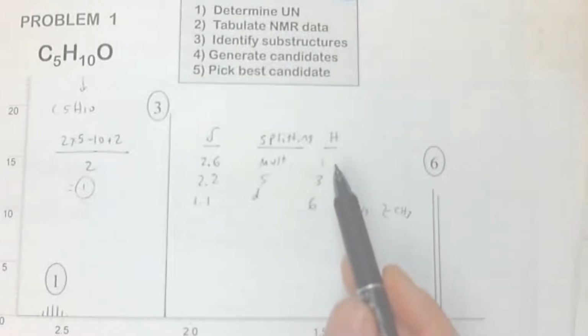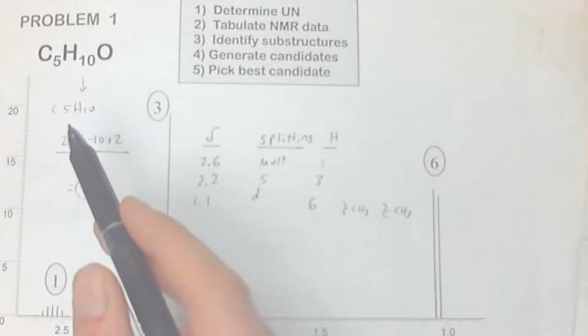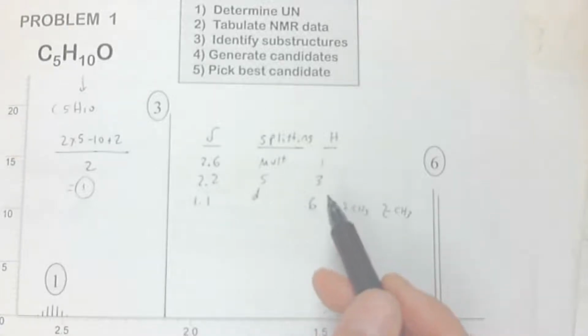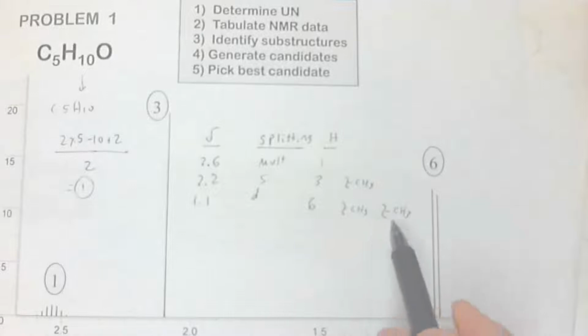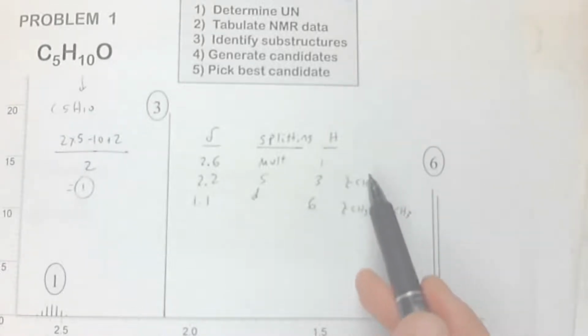What about the top? Well, what there's 3 here is probably 1 CH3, right? Now, it's a possibility it's like 3 CHs. You'll see that you'd run out of carbons, and so that's impossible. Most likely, if you see 3s and 6s, it's just CH3s, okay? So it's another CH3, a different CH3. We have 2 CH3s. What about this? 1 we said was, let me say it.